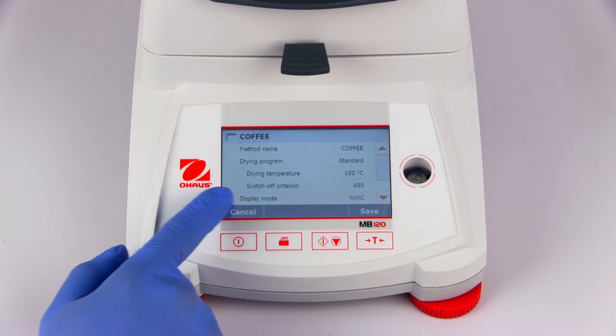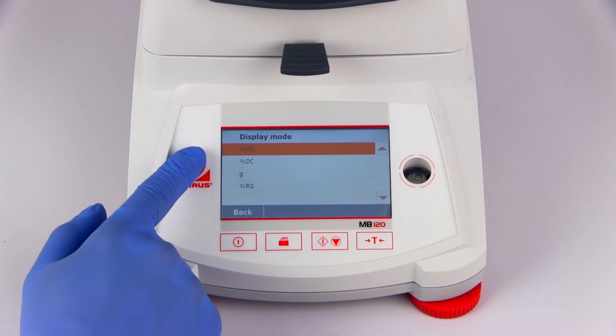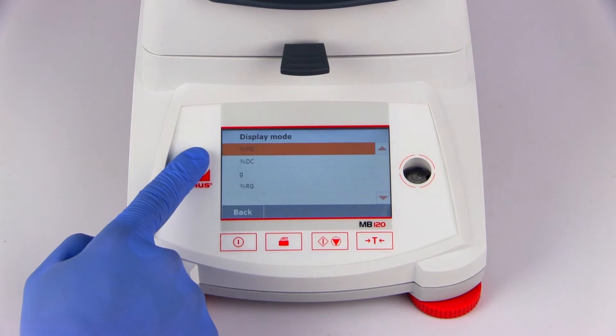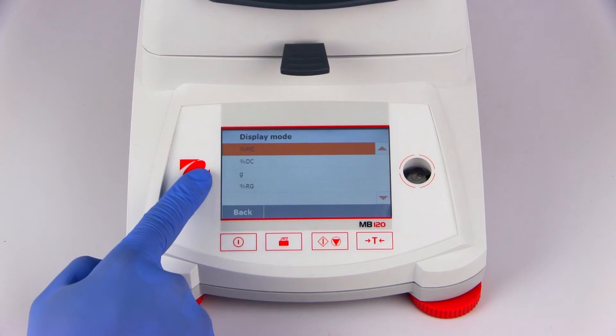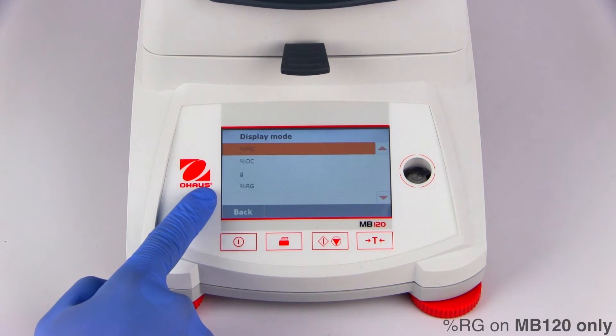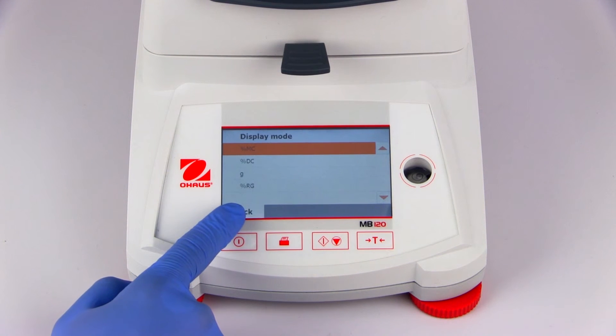Next, a display mode may be selected. Most measurements will use the percent moisture content unit of measure. However, percentage dry content, weight in grams, or percentage regain units are also available.